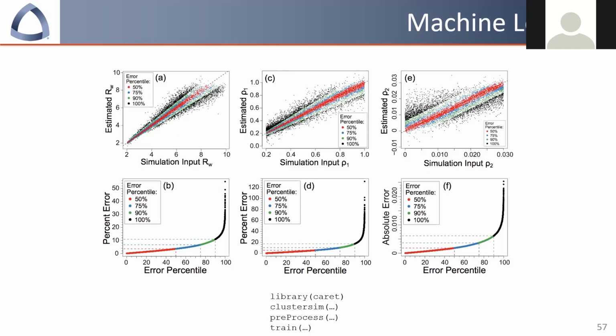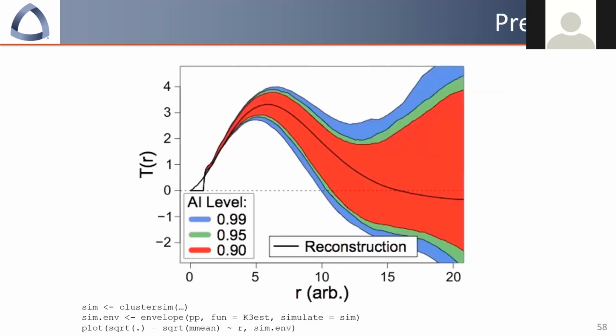Similarly, with that information, we can then do prediction on our observed data, where we simulate a pattern that uses all these parameters that we've tested in our trained machine learning algorithm, and compare that with the spatial statistics function. If we compare that simulated data with our original observed atom probe data, we can see that for the most part, we match the distribution of those points, and that gives us a pretty good idea of where those things are sitting. So all of this basically lets us characterize aggregate properties of clustering and identify those features.